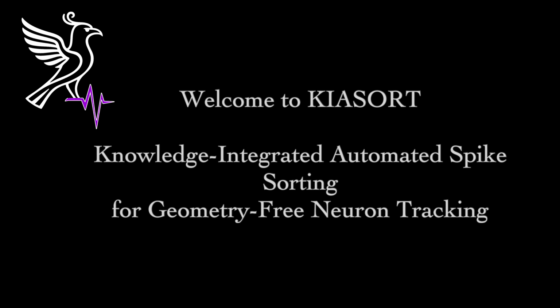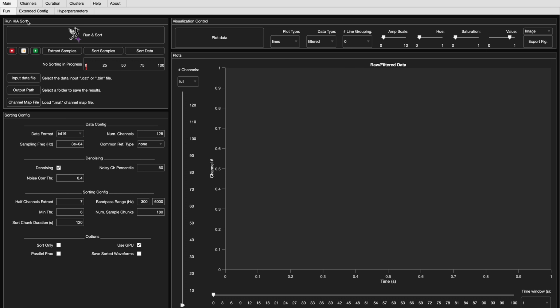Welcome to KIASORT, knowledge-integrated automated spike sorting. In the next few minutes, we'll walk through the interface that puts you in control of sorting large-scale neural data.